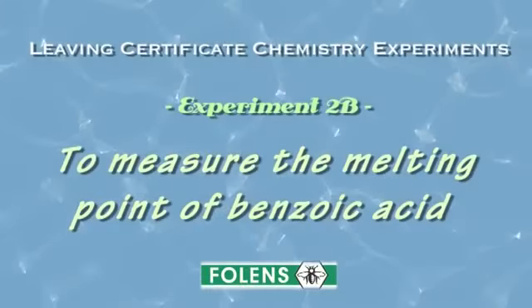Experiment: to measure the melting point of benzoic acid. In this experiment, we will measure the melting point of the benzoic acid crystals formed in the first half of the experiment. Since the melting point of benzoic acid is greater than 100 degrees Celsius, we use an aluminium melting point block.